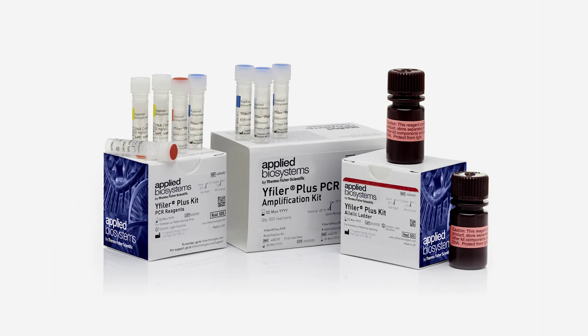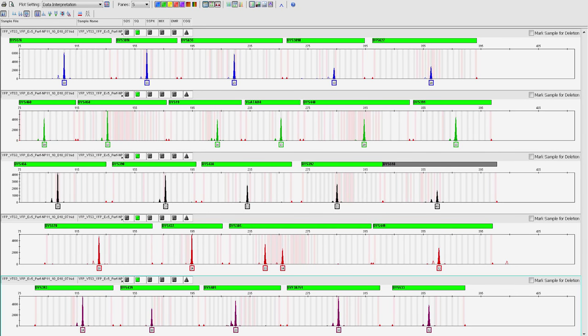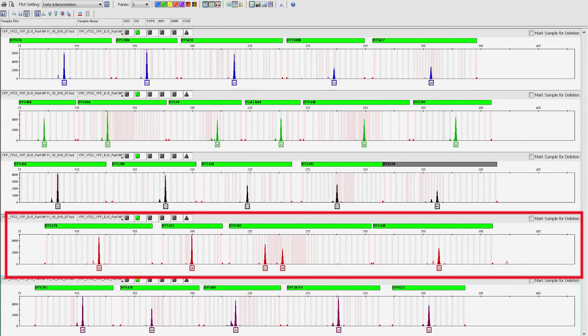Now this is where YFiler Plus kit comes into play. YFiler Plus is the first 6-dye, 27-multiplex YSTR kit that has 7 rapidly mutating YSTRs and 11 mini-YSTRs. This sample was in fact processed with YFiler Plus, and here is the profile viewed in GeneMapper IDX analysis software. For this sample, we had an initial male concentration of 0.07 nanograms per microliter, which allowed for an amplification input of 0.7 nanograms of male DNA and a total input of 10,000 nanograms of female DNA. As you can see here, even with a large amount of female DNA being present, we were able to still get a full male profile, without any artifacts, and obtain optimal intracolor balance.